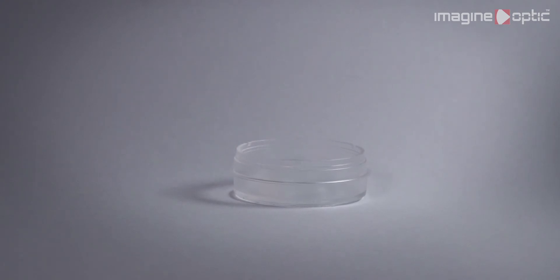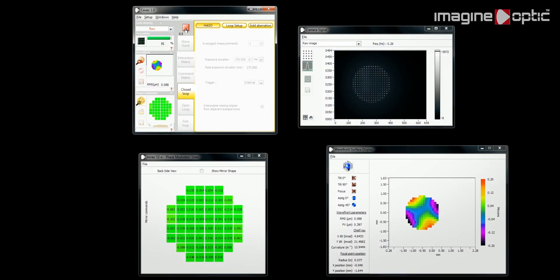For this, we use the same 1 micron fluorescent bead embedded in agarose as a point source. Using this direct measurement of the aberrated wavefront, the deformable mirror changes its shape to get a perfectly flat wavefront.